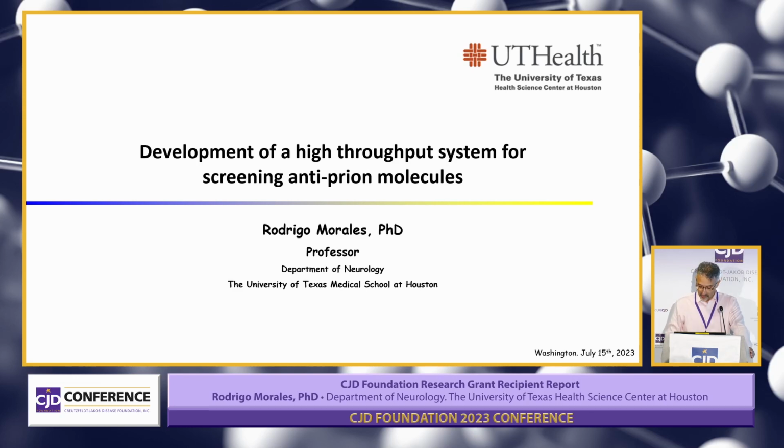So, I will be talking today about our attempts to increase the throughput of the PMCA technology, this prion amplification technique, with the aim to look for compounds able to inhibit prion replication, but we want to take a focus on specific prion strains. And I hope to convince you why this is really important to consider.